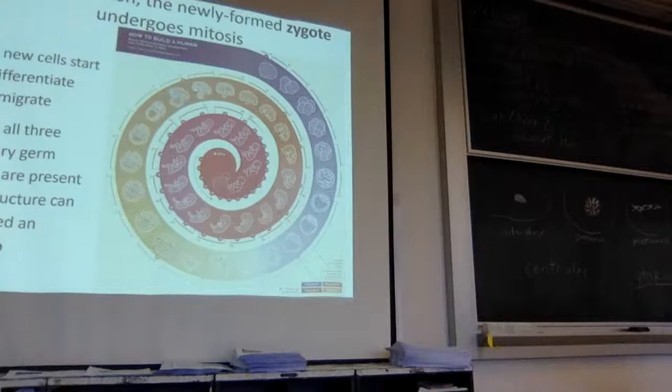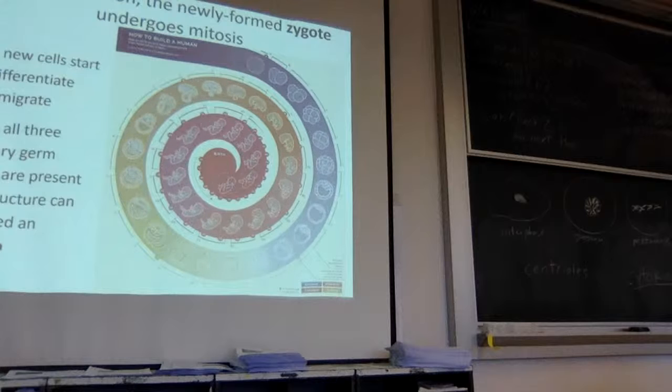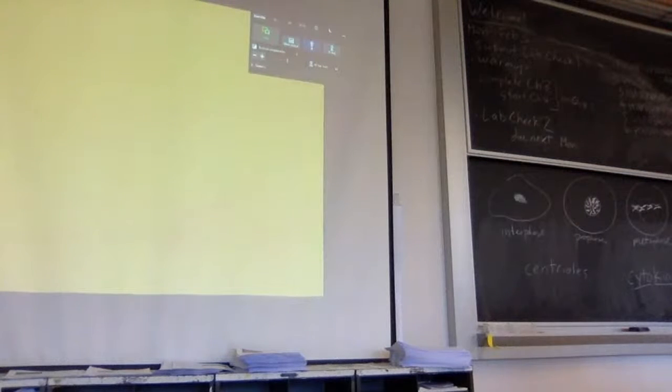Let me show you real quick. There's a microscope. The slide that I have here, it's called fish mitosis. So basically, these are fertilized fish embryos. They're fish embryos, and if you look real close, there's 9 of them. There's a grid of 9. They're each a different developing embryo. And so basically it's been sliced so that you can see a cluster of cells in each one of these 9. I'm going to zoom in on one.